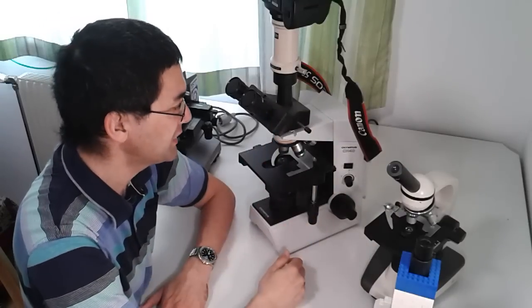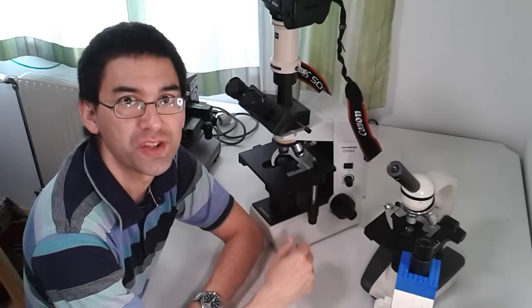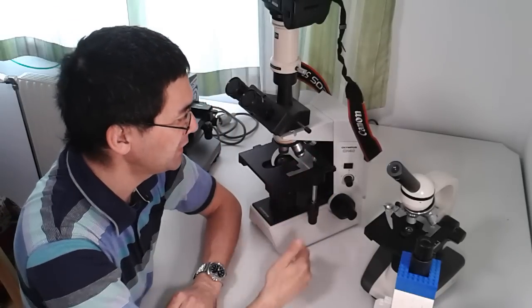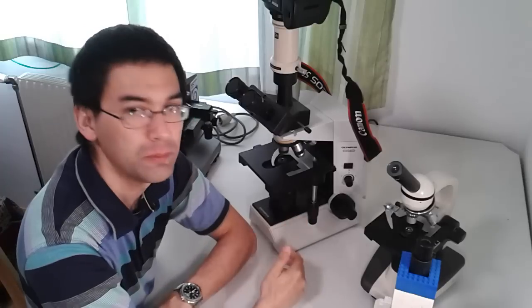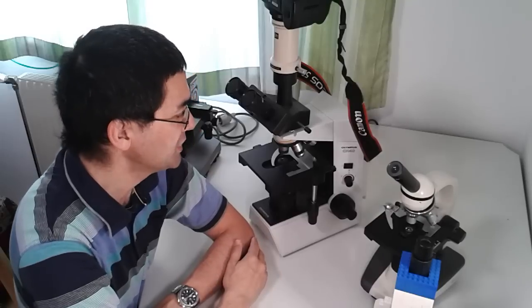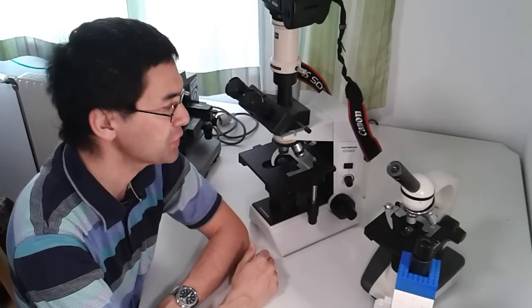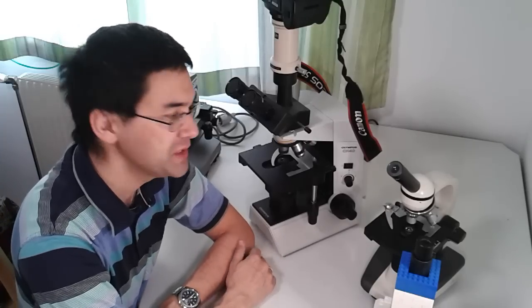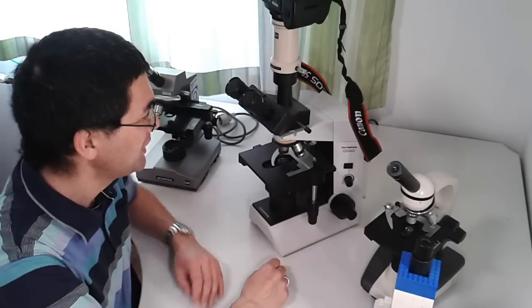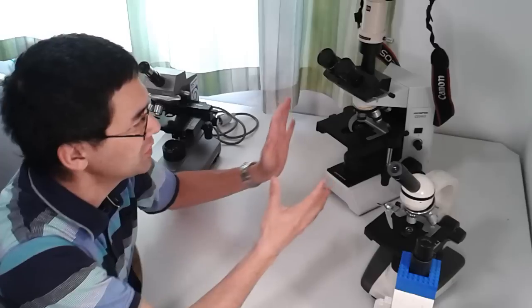The adapter alone costs more than a separate low-cost microscope. If you were to buy the CH40 used, I found it on eBay for around €1,200–1,300 without the photo tube. With everything as you see it here, it probably still has a value of around €2,000. I bought this microscope 20 years ago when I finished university and it's still as good as new — that's what quality means.